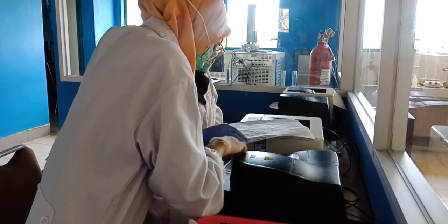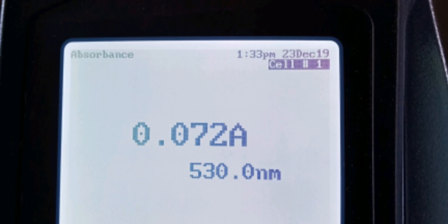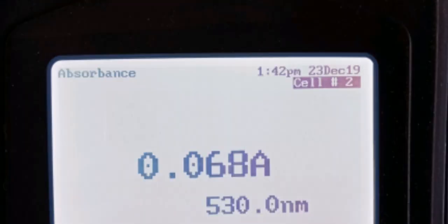Selanjutnya, kita juga melakukan pengujian melalui spektrofotometer UV-Vis dan didapatkan hasil. Untuk absorbansi blanko, didapatkan hasil 0,000. Untuk absorbansi limbah sebelum disaring, didapatkan hasil 0,072. Dan untuk limbah setelah disaring, didapatkan hasil 0,068.